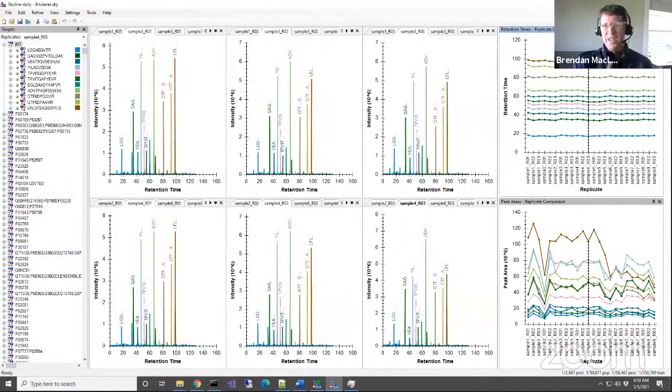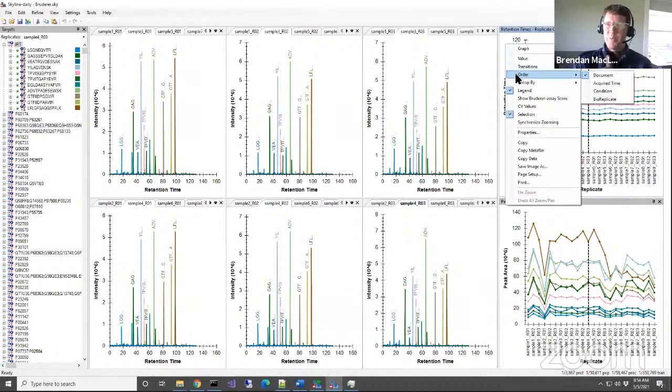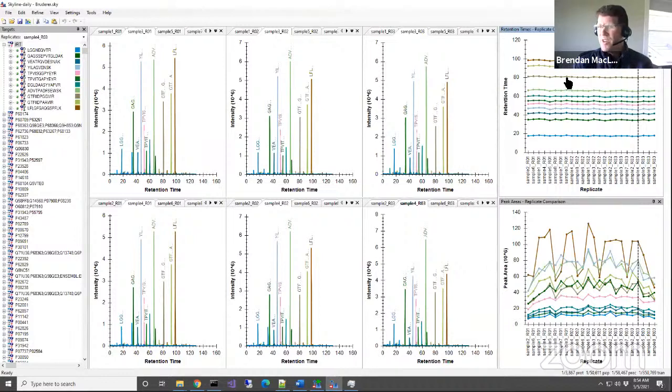Another thing that we might want to do here is to right click and order by acquired time, because that was just the logical time. It's actually really interesting to look at acquired time, because, okay, we're in a statistics class. What do we like?